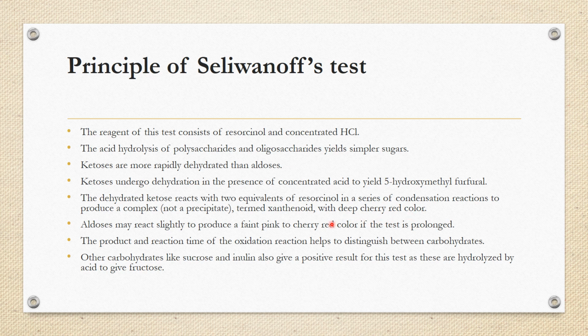So this is the positive result for the test, with the formation of a deep cherry red color.